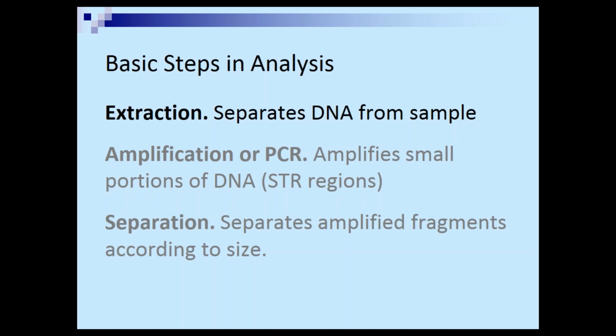So you just want to purify the DNA. There are several methods of doing that. The method that we use in our lab, and that's automated in a lot of labs, is you pass it through this sort of silica gel membrane almost, although it's more of a disc. And the DNA sticks to the silica and all the junk washes through. And then you go back and you wash the DNA off the silica and catch it in a clean tube.